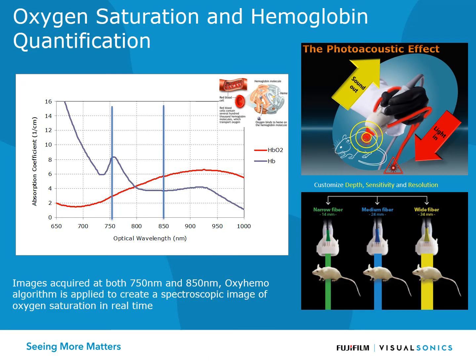The photoacoustic phenomenon is a combination of light converted into sound waves. So we have here an optical fiber that is connected to a tunable laser, and we can select a specific wavelength at which, as an example, the oxyhemoglobin or deoxyhemoglobin absorbs the light. So when absorbing the light, a thermoelastic expansion phenomenon is produced, and this phenomenon is converted into a sound wave. So to summarize, you send light and you detect sound waves.